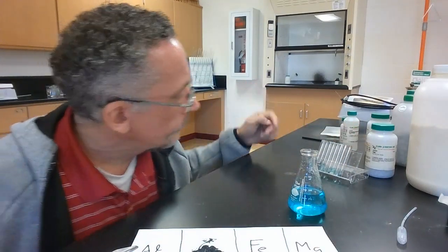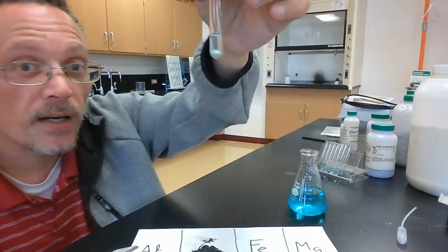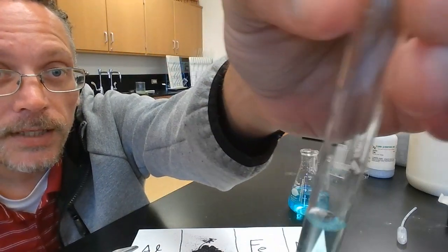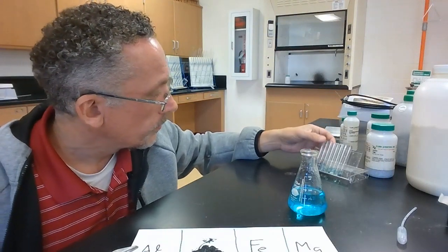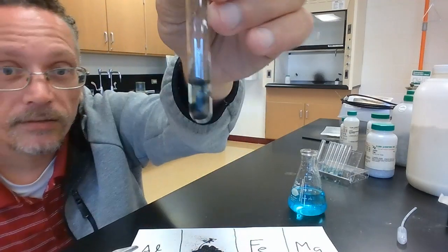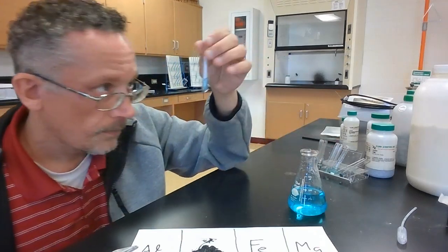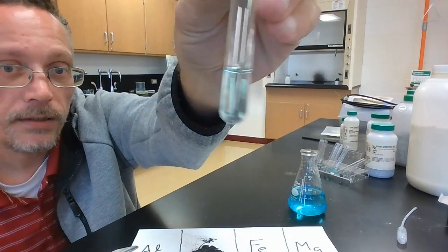Now, you can see a few reactions starting to happen here. If you look at my aluminum, it's got some bubbles forming on it. It tells me there's a reaction going on. The carbon doesn't look to be doing anything really at all. There's like a mess in there. Iron, I don't see anything happening there just yet.